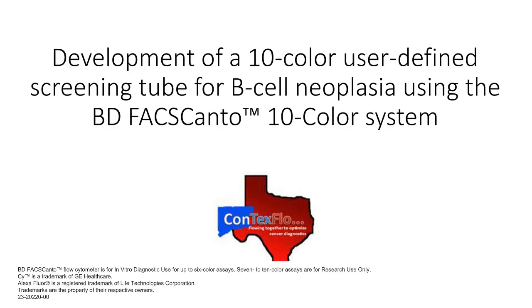All right, so Dr. Dorfman, I'm going to take this question to you, Jeff. He asks, what does your 10-color T-cell tube look like? It's not quite ready for prime time, but we're getting close. In February, we expect to be presenting it. Yep. So stay tuned for a webinar in February to see that.